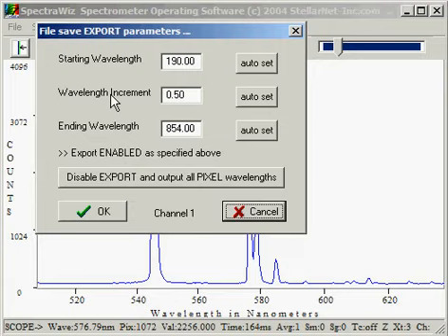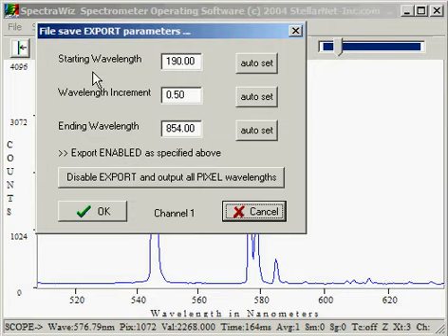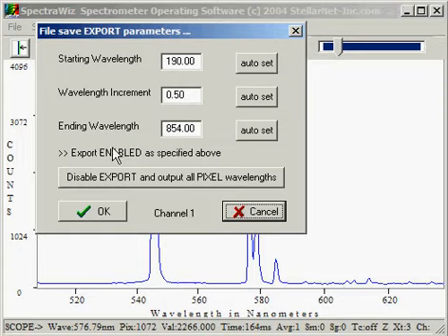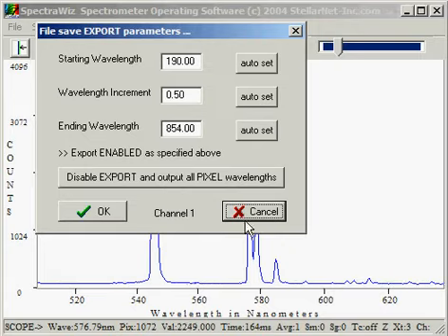The Export option allows us to reduce the dataset that we saved to a file by specifying the starting wavelength, the increment, and the ending wavelength. Alternately, we can specify to output all pixel wavelengths from our detector array.